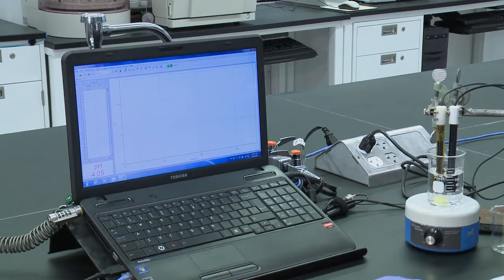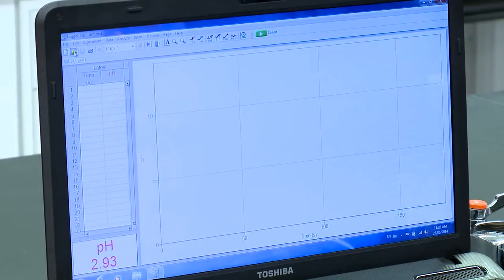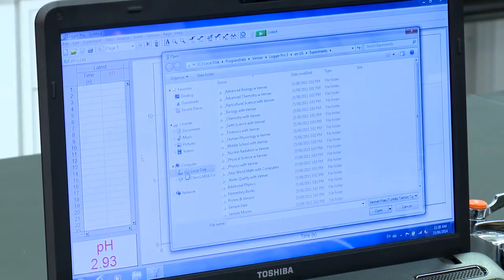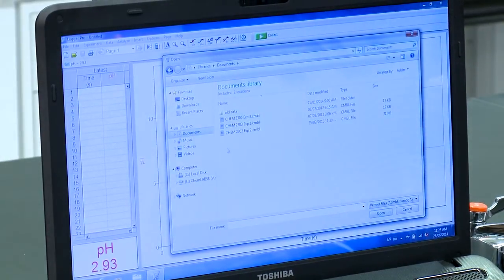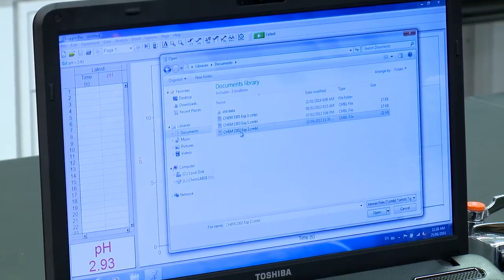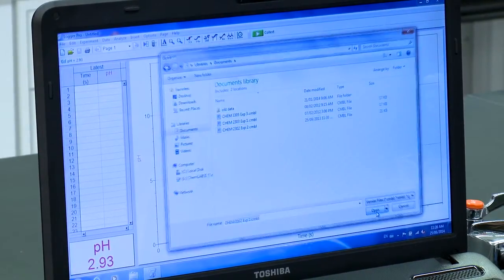And then you want to ensure that the correct program has been loaded by clicking on Open, going to Documents, and then opening the Chem 2302 Experiment 2 file.